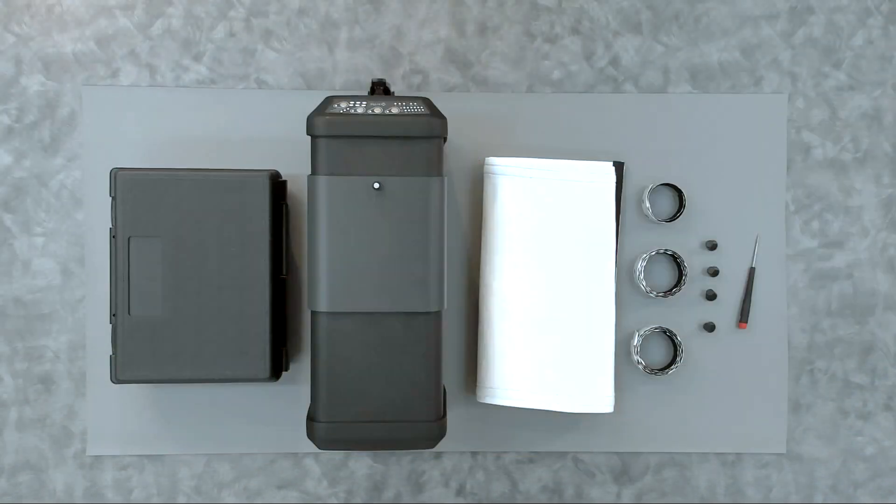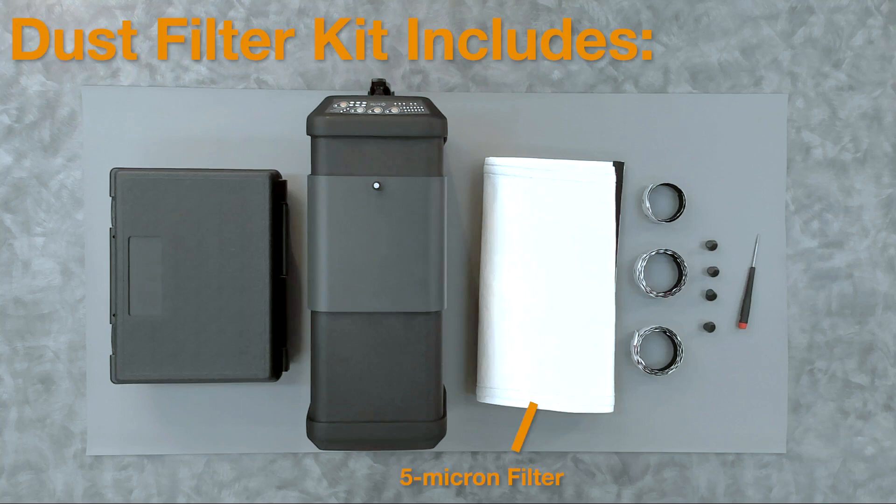The X-Rite Benchtop Filter Kit was developed for such scenarios. The kit uses a 5 micron filter, which allows air to pass while stopping the dust.